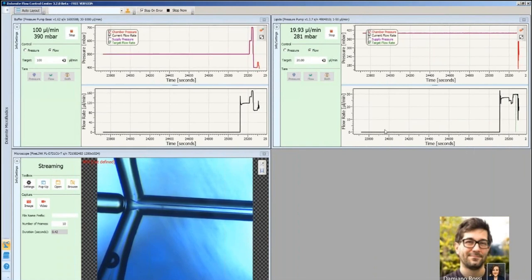Here, the charts that you see on the right side of each tab are a sort of history of all the operations that we have undertaken. Since we started the experiment, you can export these charts using a log file.